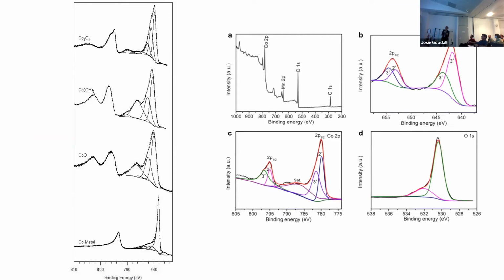So they've come up with a 2+ 3+ ratio there. Also, a really weird outcome, which I'm not sure how they've achieved. But a 2+ 3+ ratio, which if you actually compare the cobalt 2p spectrum to the cobalt monoxide, it looks pretty similar. So they may well just have really had a cobalt 2+ ratio there.